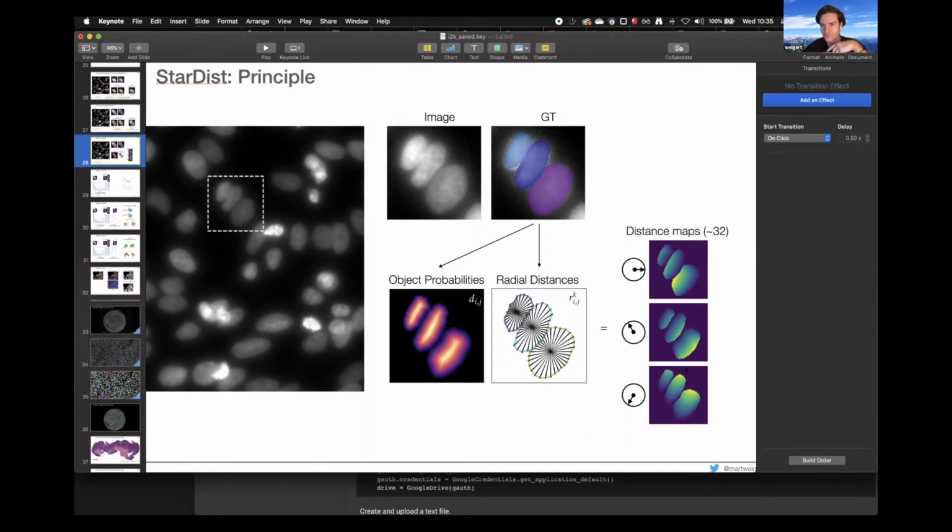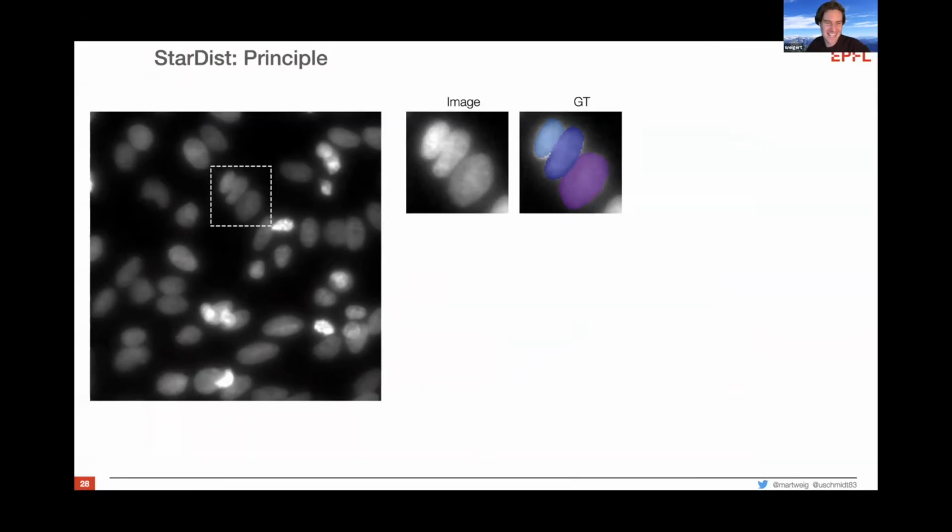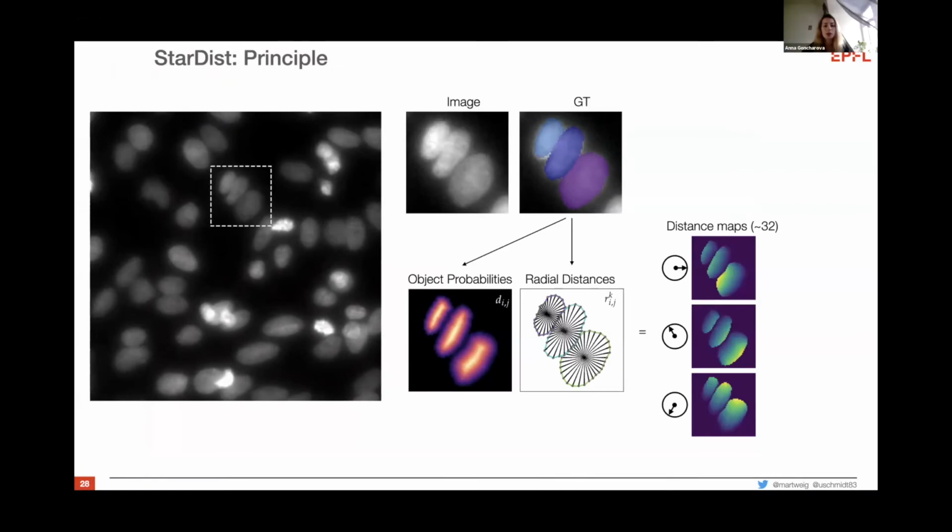And in your case, the distribution of the intensities in the object is almost uniform. So in my case, I have only membrane markers. Can it be the case that StarDist cannot work properly, or with proper training, can I get some good results as well? If you only have membrane instead of a nuclei marker? Yeah, I have membrane markers only, so I have only borders, and inside it's almost the same as background. But this doesn't matter, right?